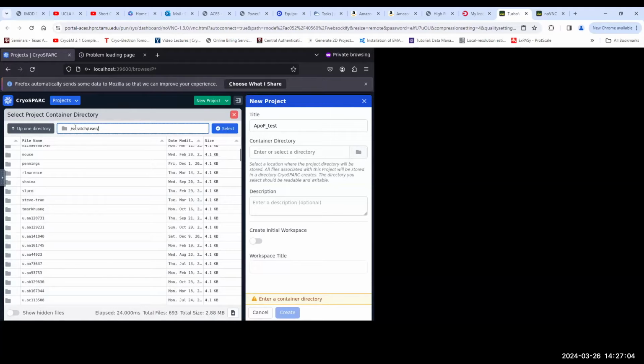So you put /scratch/user/ and find out your username.